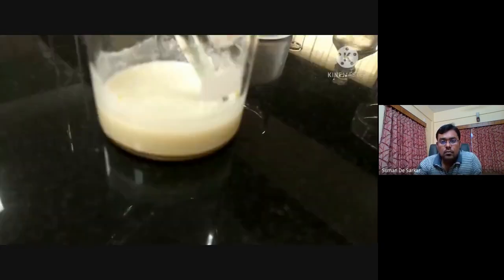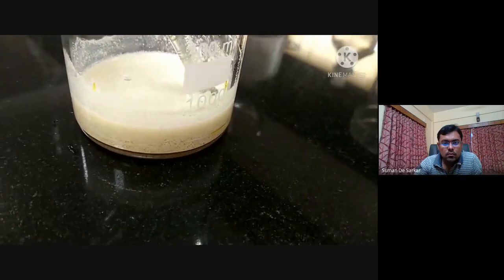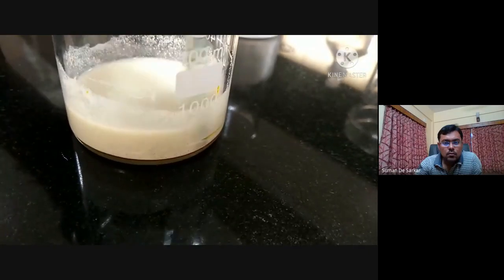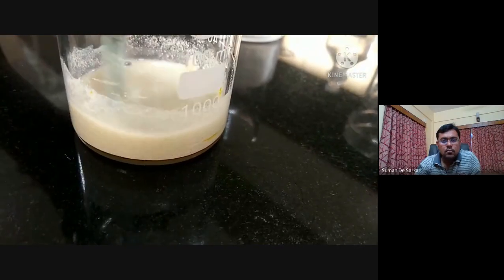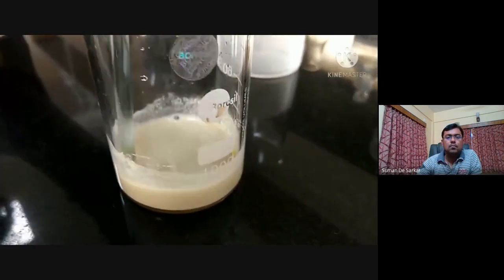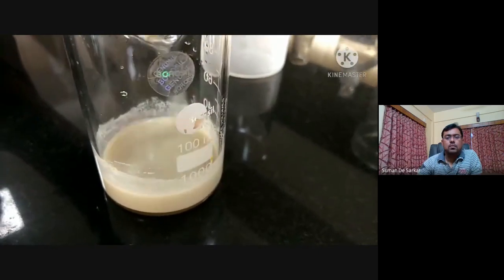You can see it's getting settled down here. Maybe stir a little bit. Yeah, slowly, stir slowly. You can see the precipitate of the indole. We'll wait for a few more minutes, and then, as usual, filter it.